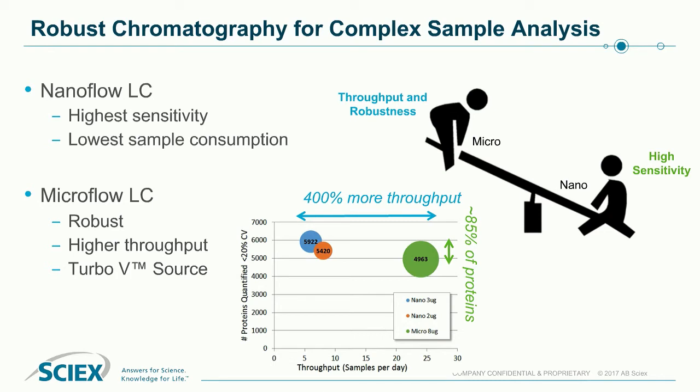So we're questioning how can we generate the same quality data at much higher flow rates. And what we've come to the conclusion at the moment is that the microflow LC regime probably offers the better compromise between sensitivity and throughput, and also puts it all into the same industrial setups that are used across many different quantitative applications.